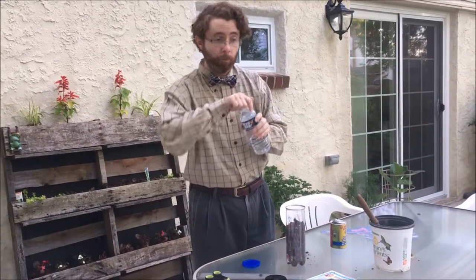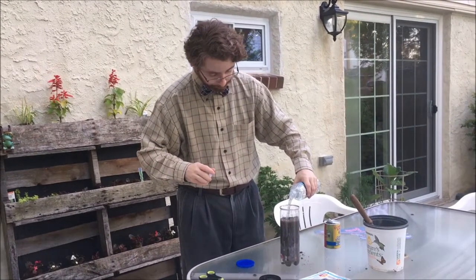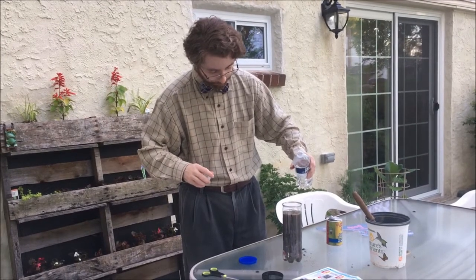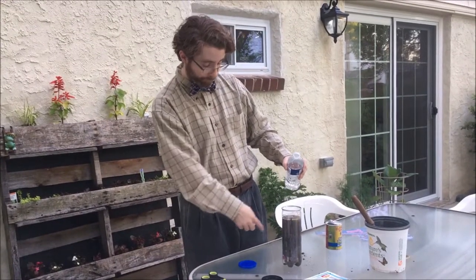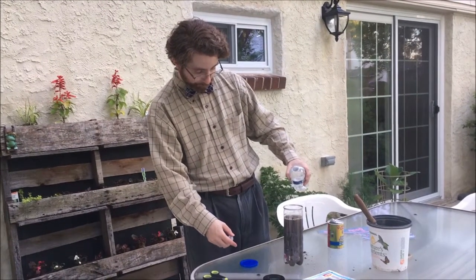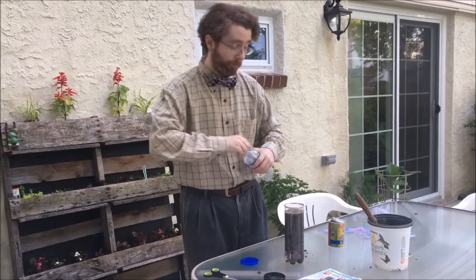We then take our water — again, not tap water, either rainwater, stream water, or purified or distilled water — and we're going to just pour in a little, that way you can allow the water to percolate down. And then top it off.